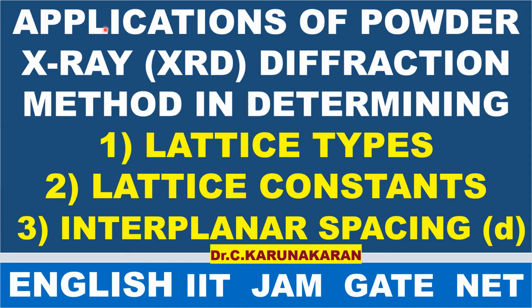Good morning. In this class, we will study the applications of the powder XRD method. There are three important applications. One, determining lattice types, whether simple cubic lattice, FCC lattice, or body-centered cubic lattice.